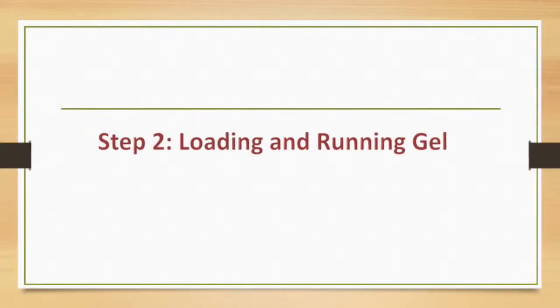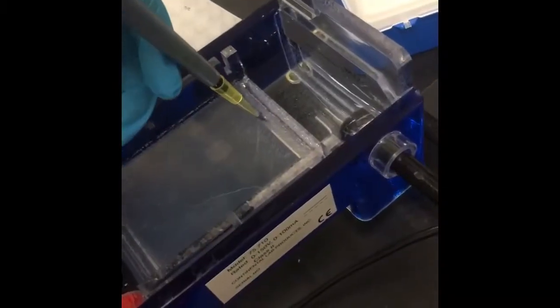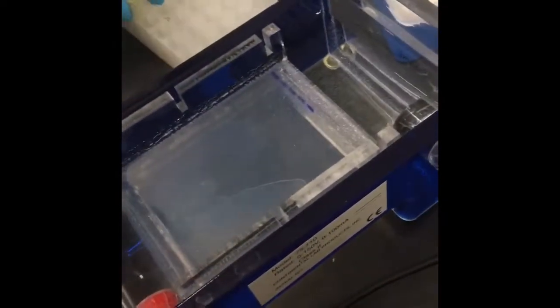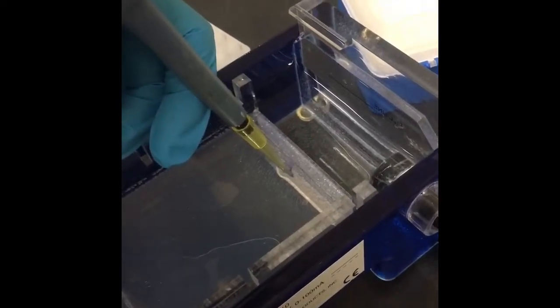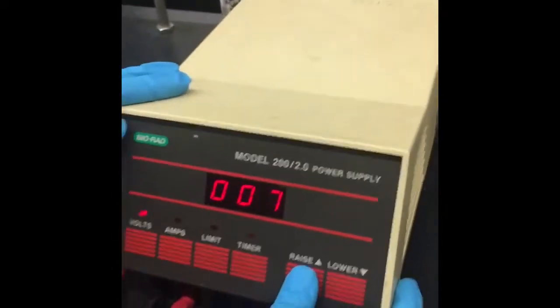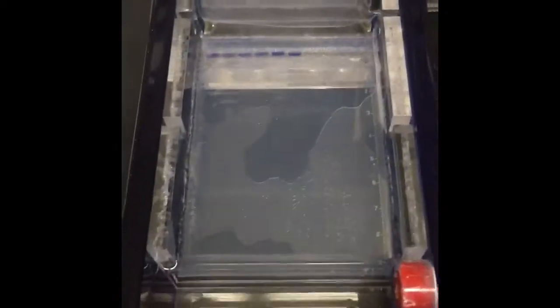Step 2 is loading and running the gel. Lane 1 is the sickle cell gene sample, lane 2 is the sickle cell carrier sample, lane 3 is the normal gene sample, lane 4 is mother's DNA, lane 5 is child's DNA, and lane 6 is father's DNA. After we have loaded all the samples into our agarose gel, we connect the electrodes to the voltage machine and set the voltage to 130 volts. We let it run for an hour.